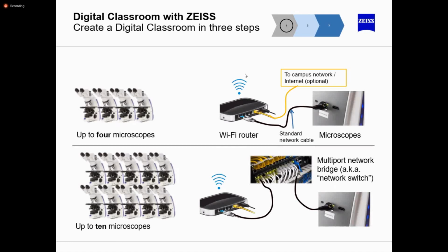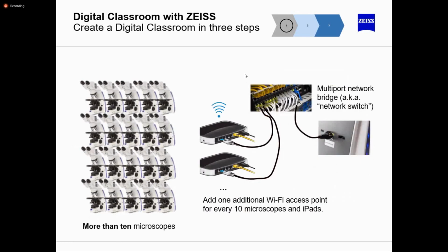For connecting the microscope, in fact, it is the microscope camera fixed on the microscope. For connecting that, we use routers. There are different types of routers available depending upon the number of systems to be connected. And one more important thing is if you are buying a few microscopes in the beginning, you can increase it to many in the future by adding these routers.